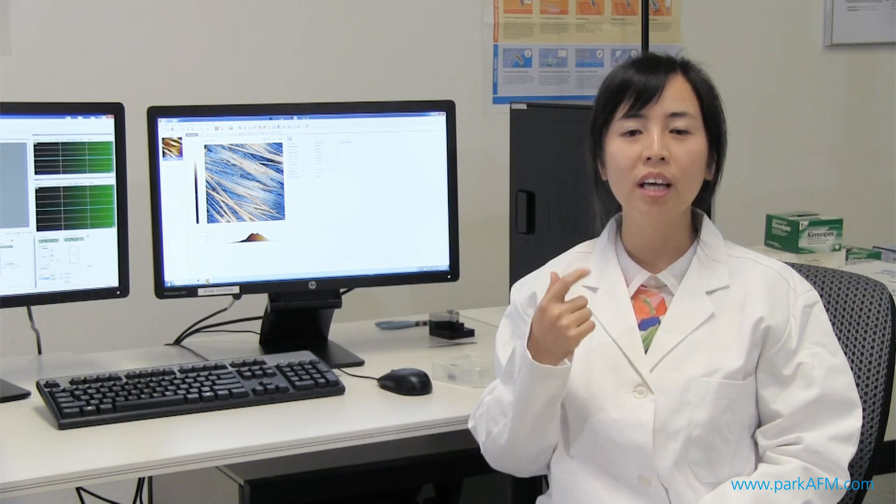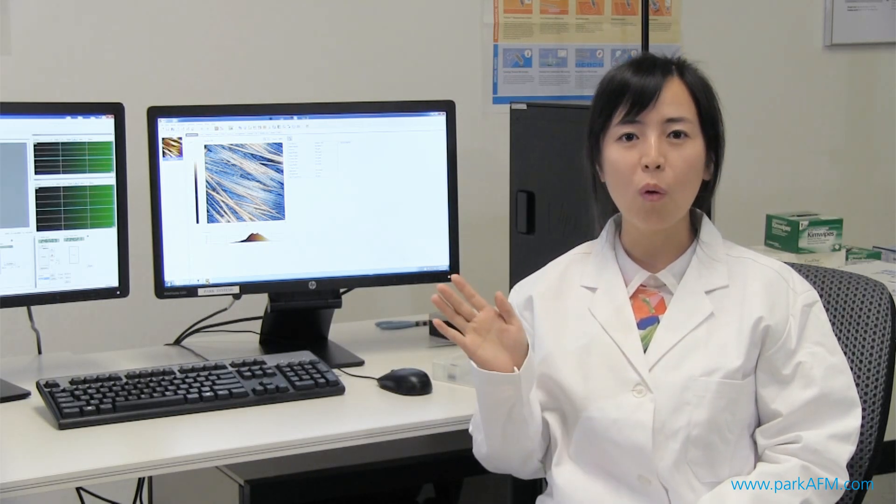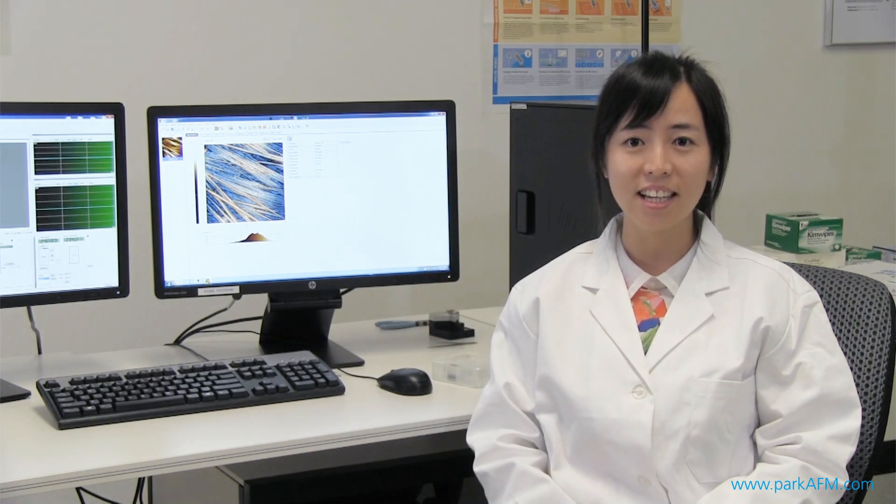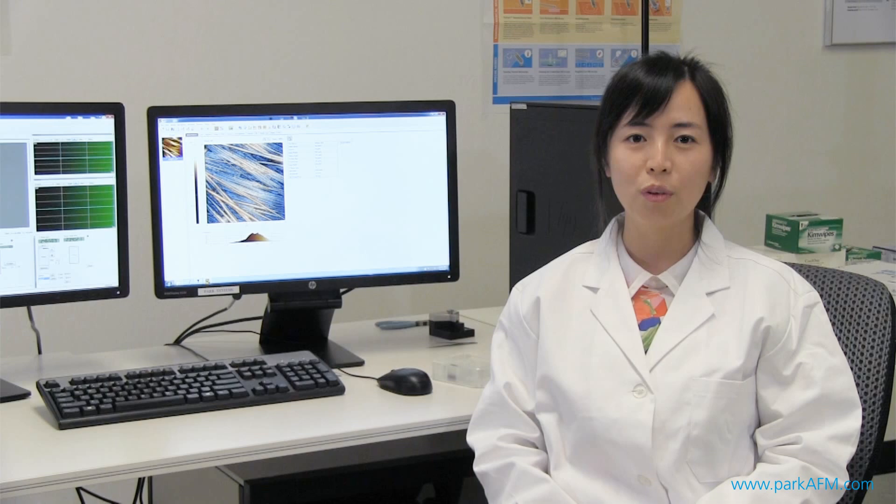Analytical chemistry, electrochemistry, cell biology—challenges are met by the PARC NX10 SICM, the new standard for nanotechnology imaging in aqueous environments.